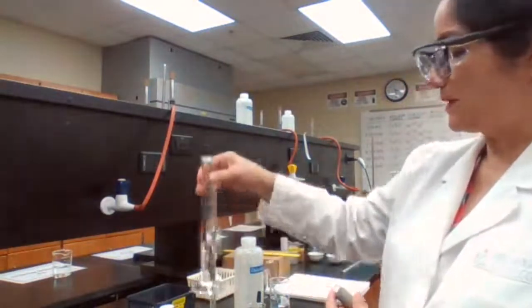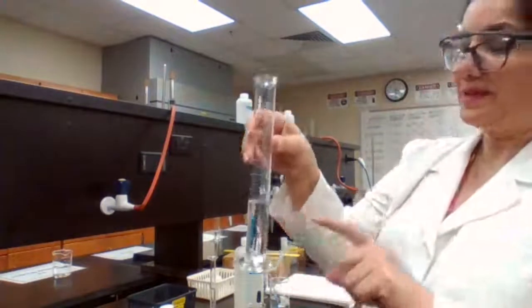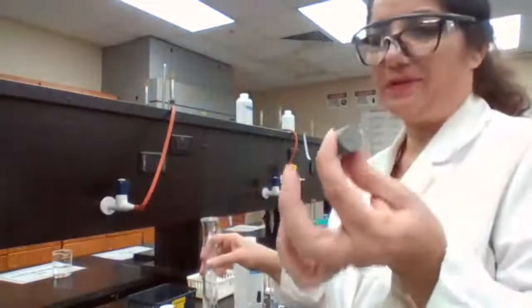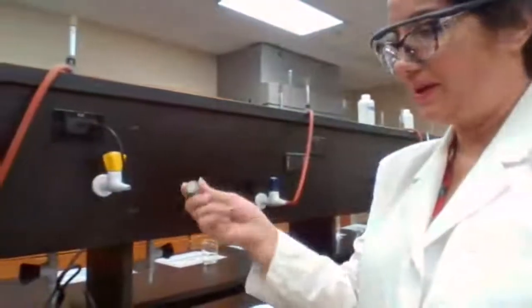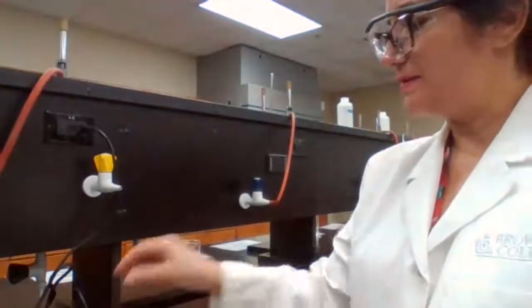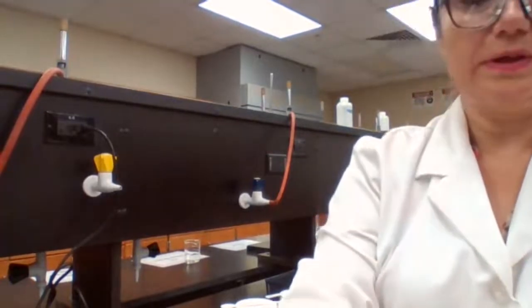Just like zinc, we are going to find the volume by displacement. But if I find the volume first, it's going to get wet. And if it does get wet, then it's going to have a different mass than a dry sample. So I have to find the mass first. So every time you're measuring mass and volume for the same object, if it's solid, measure the mass first. It's a heavy metal there. The mass is 63.397.